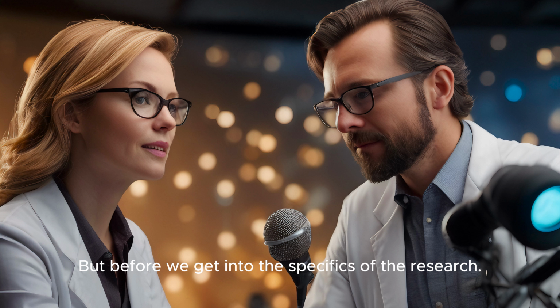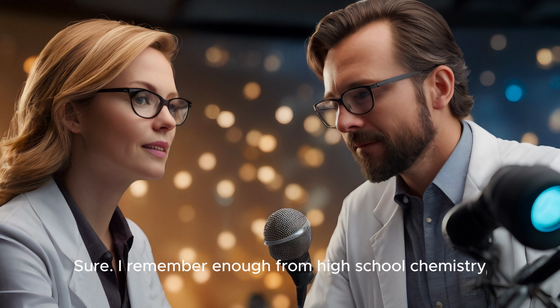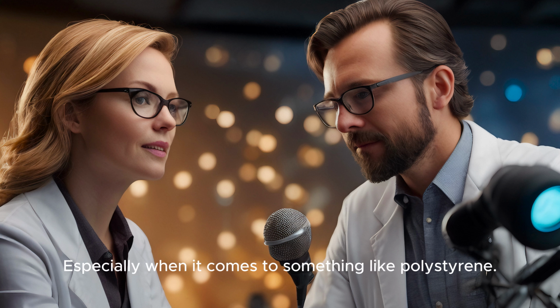But before we get into the specifics of the research, can we back up a bit? I remember enough from high school chemistry to know that isomers have the same chemical formula, but their atoms are arranged differently. Exactly. But I definitely need a refresher on how that actually plays out with polymers, especially when it comes to something like polystyrene.